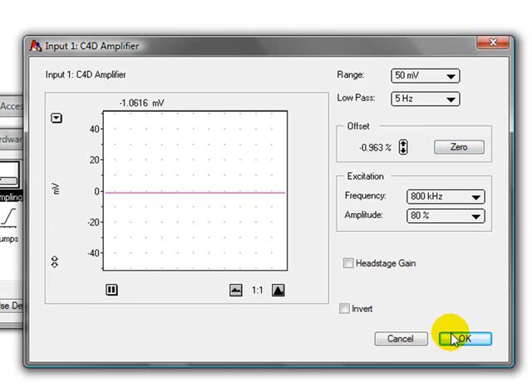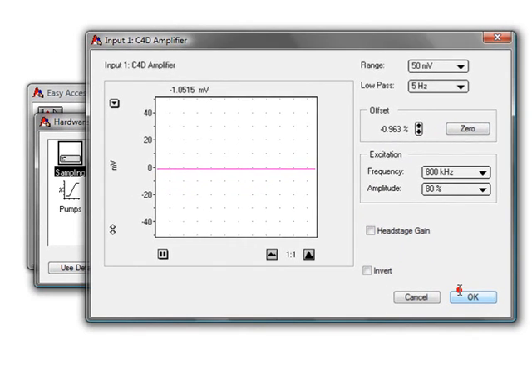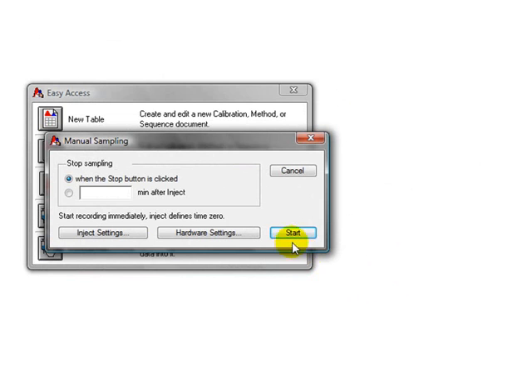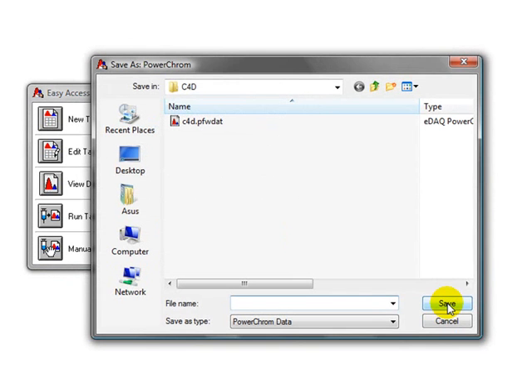You then click OK, OK, and start. And in here, you give a name and click save.